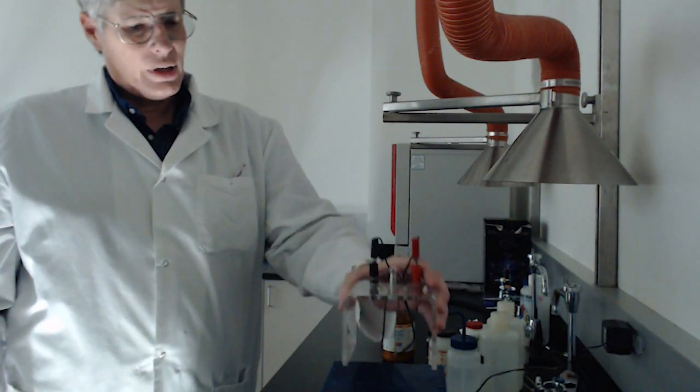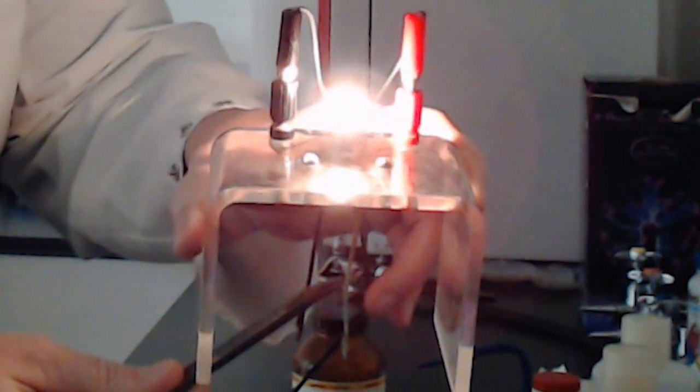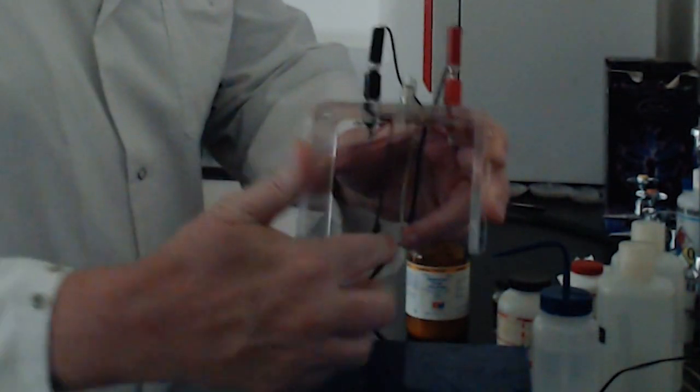And we have an old tester that used to be our lab equipment. It basically has two filaments that when something conducts electricity, the light bulb turns on like so. And if you use something that doesn't conduct electricity, it will not turn on. And the amount of electricity that goes through is shown in the relative brightness of the light. And one of the things we've discovered is that it is directly proportional to how many electrolyte ions are floating.